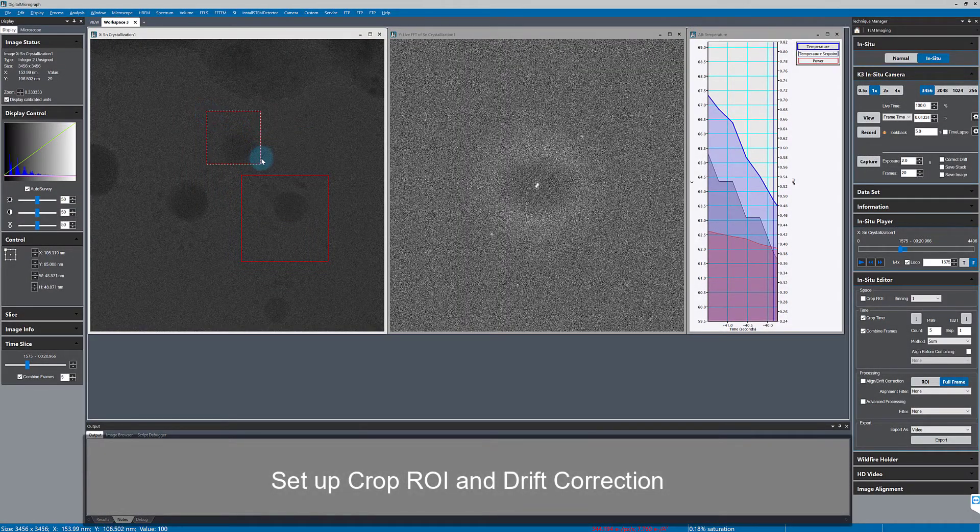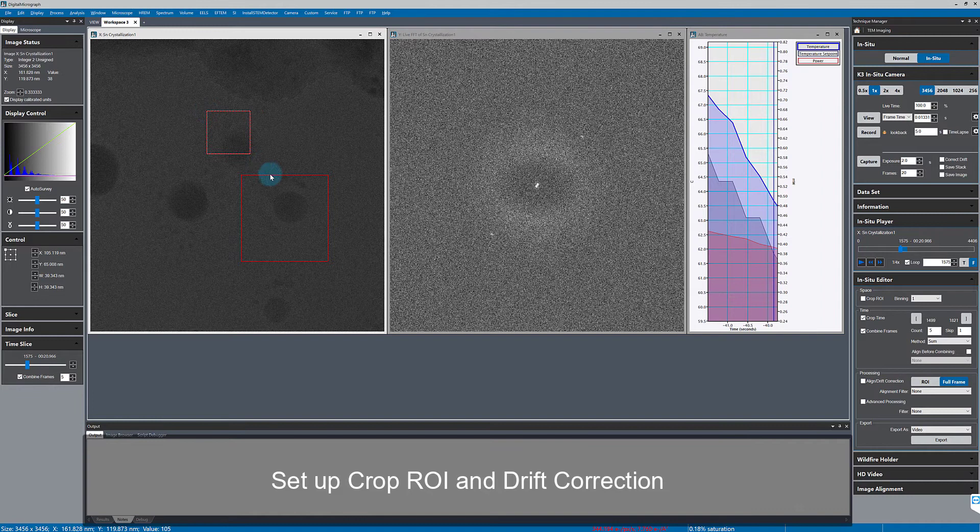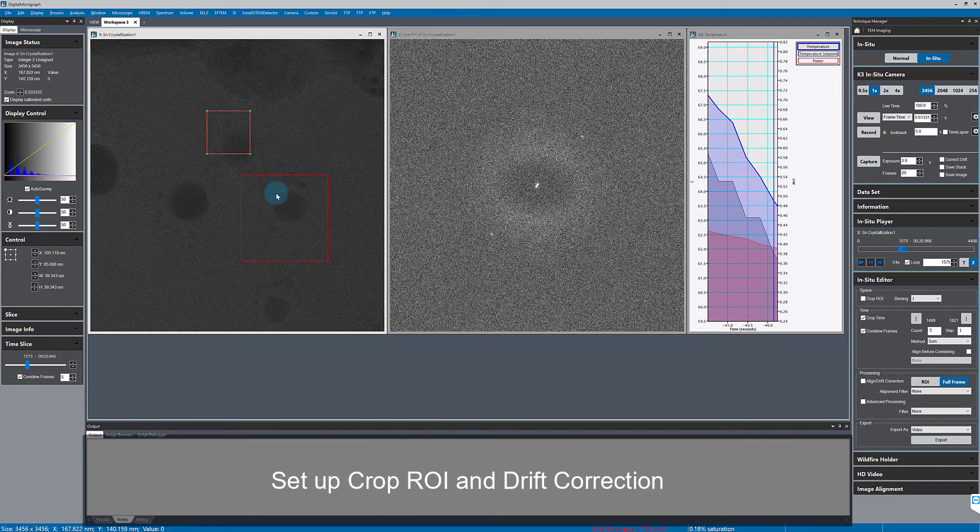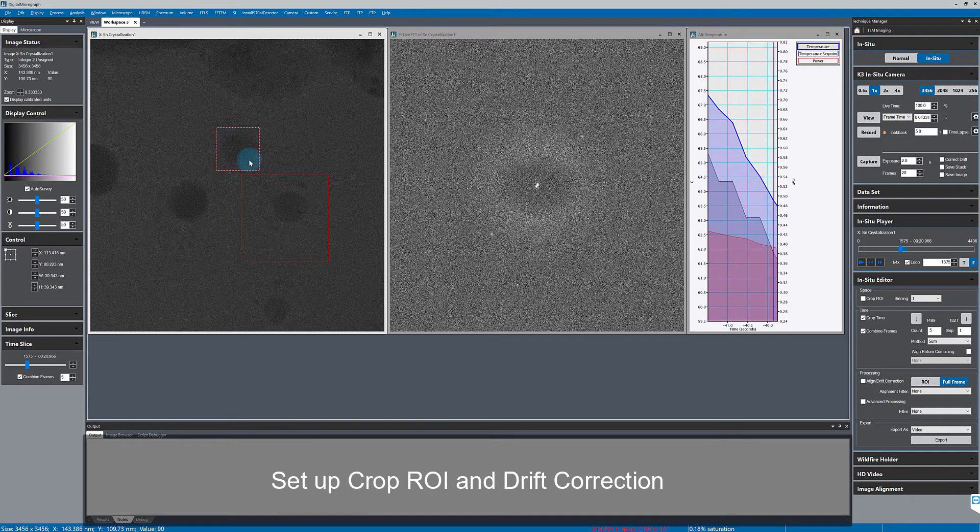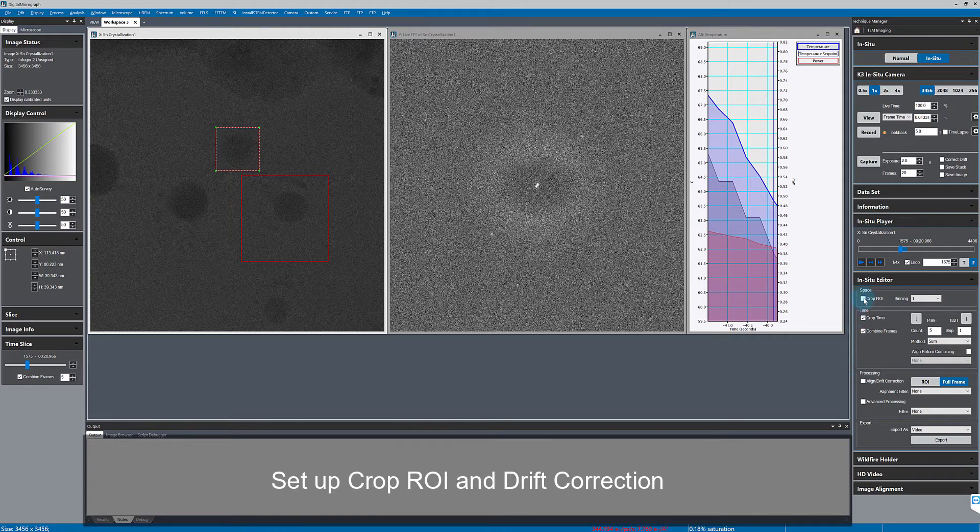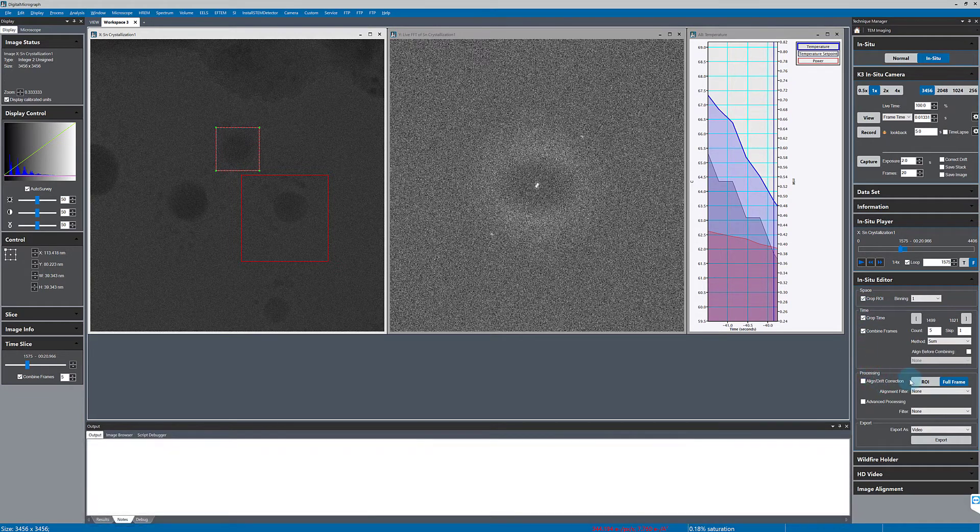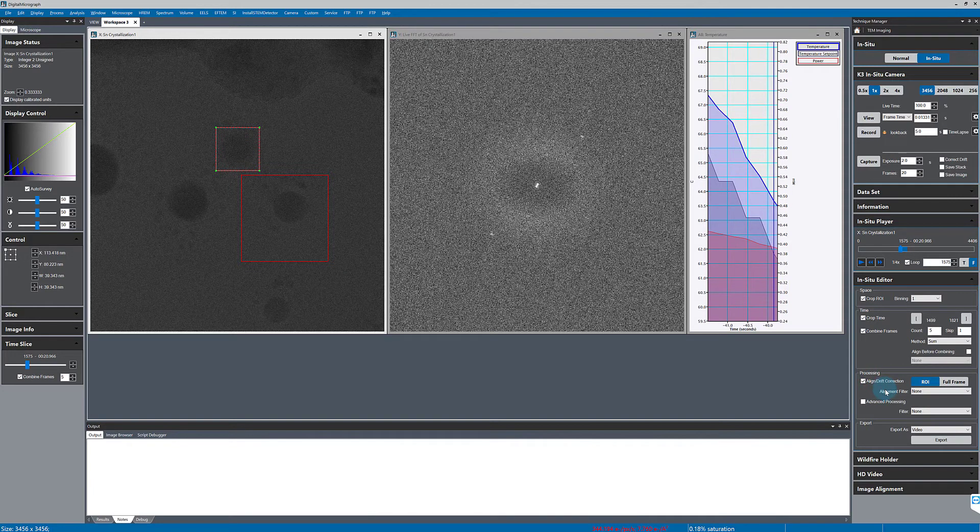In this video I'm looking at the same data set we used in the previous video. Here I'm drawing an ROI around the particle of interest and I'll use that region to align the data and also to crop just that area.